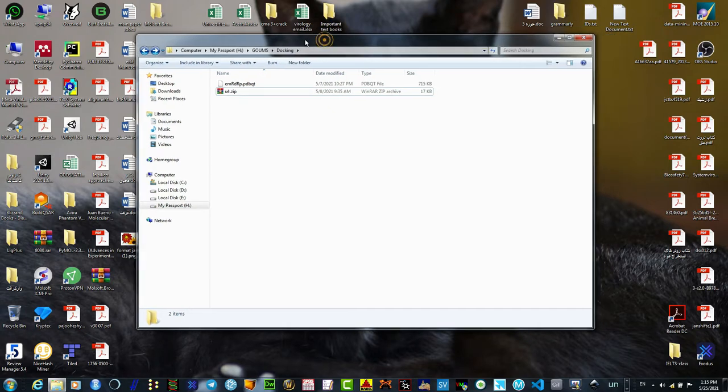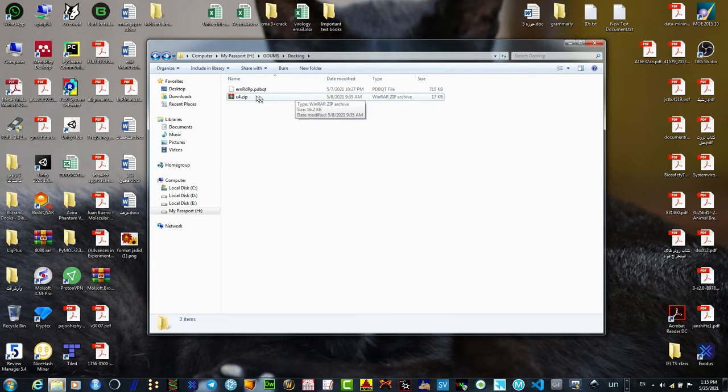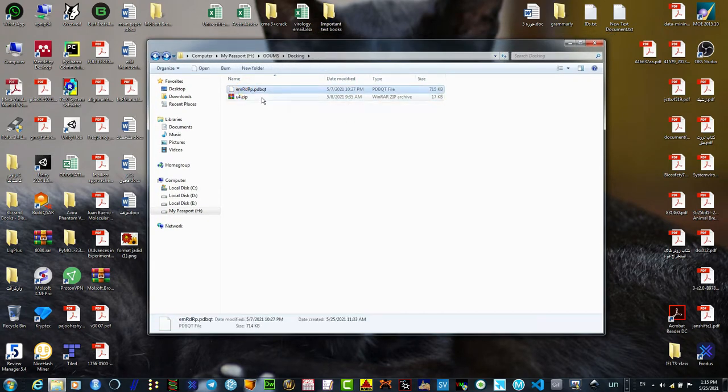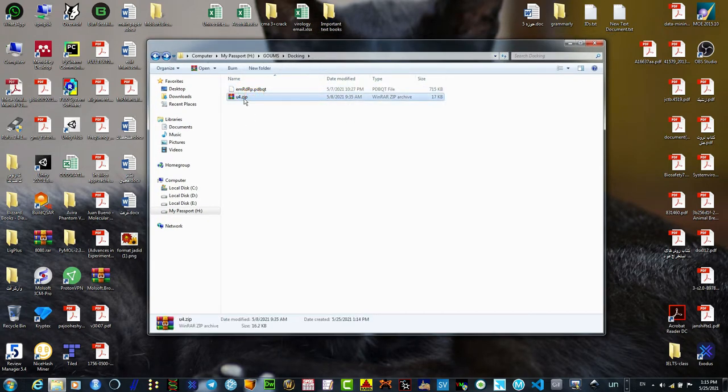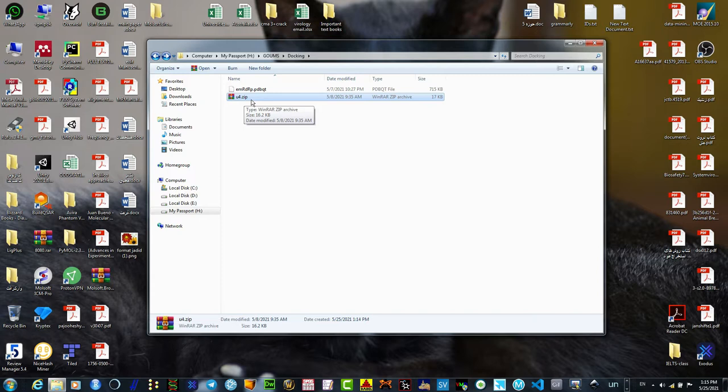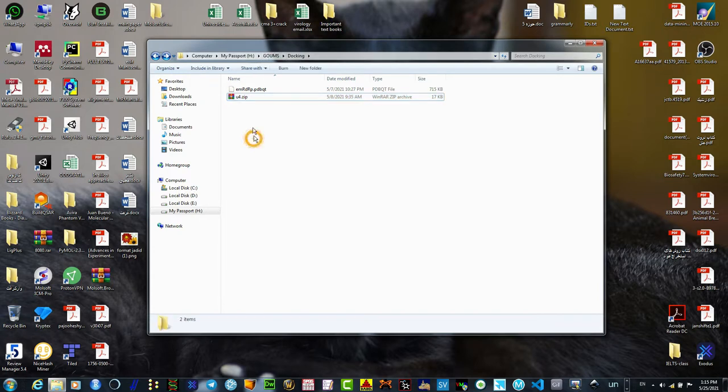Here is my directory and the molecular docking result. This is my receptor and this is the ligand I have found during the docking. High throughput screening by PyRx AutoDock Vina. I have a video on PyRx for high throughput screening by AutoDock Vina. You can check that out.